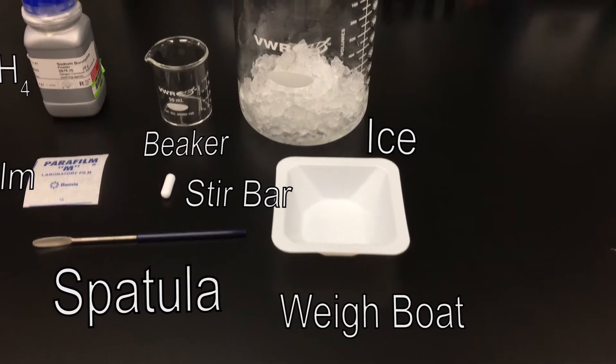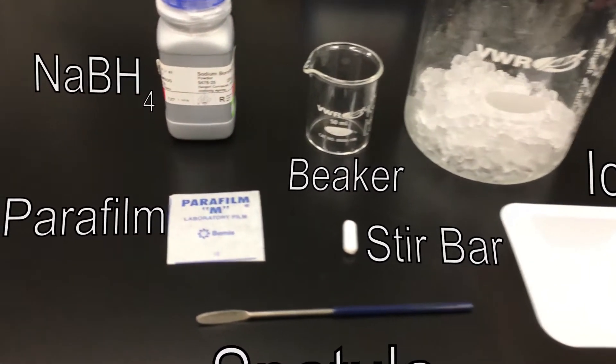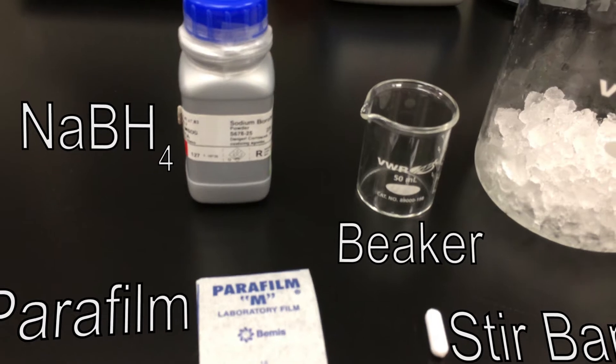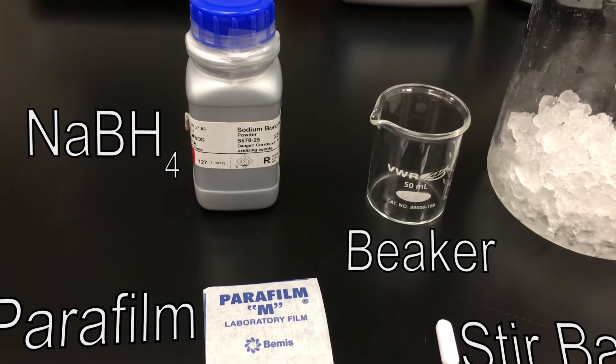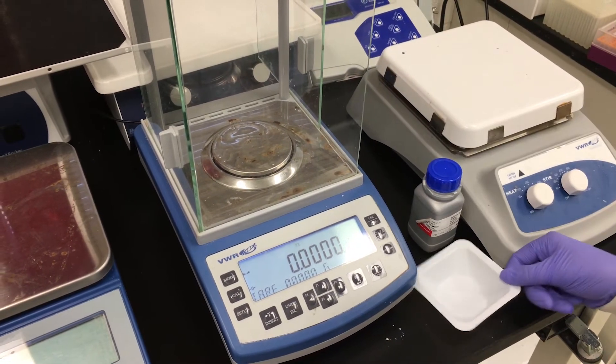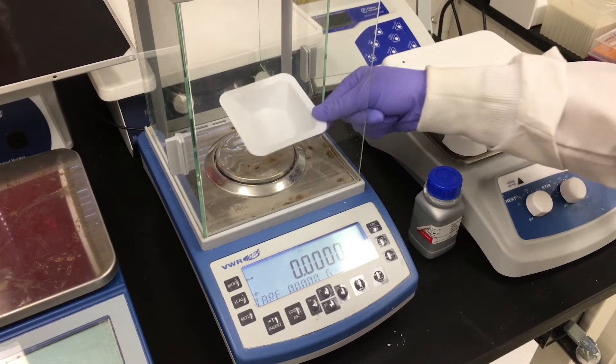Next, we will make our sodium borohydride solution to act as our reducing agent. Begin by taring your balance using your weigh boat.